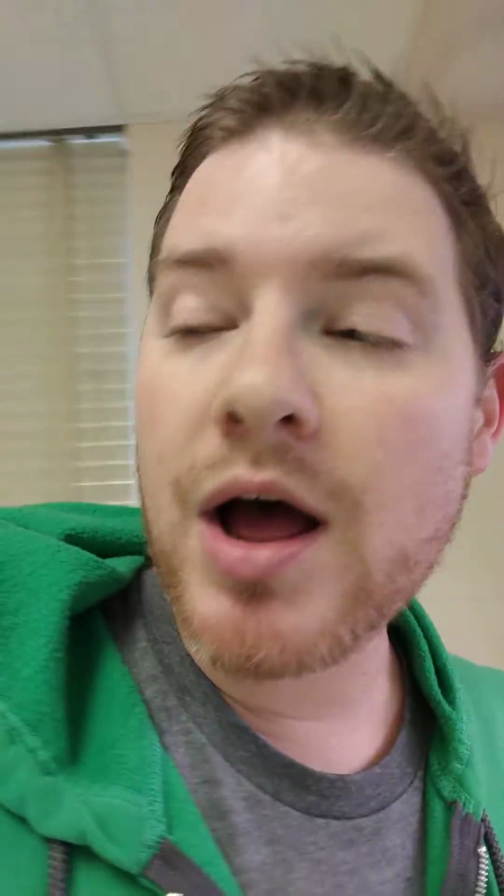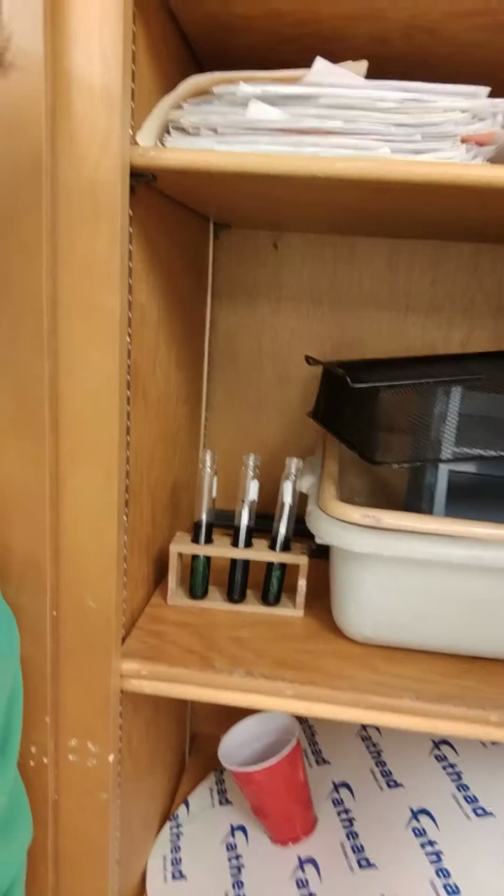Now the other set we're going to do is actually going to be locked away in the closet. So we're going to prevent it from getting sunlight. So we're going to take a look and see if there's a color change from having it be in the sunlight and not the sunlight. And we're going to take care of the other stuff on Monday, which should be today.